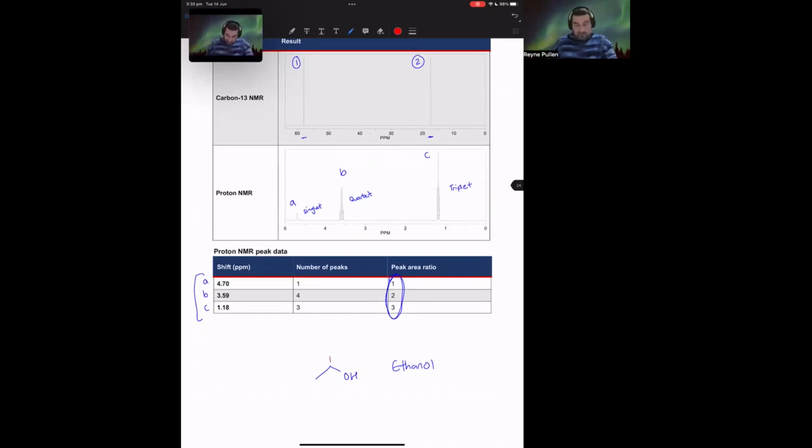This must be the one that's right next to our alcohol. Therefore, peak 2 would be further away from our alcohol and not being de-shielded. There's a bit of a waterfall effect, a little bit of overflow, but largely we can see that peak 1 has been de-shielded considerably.